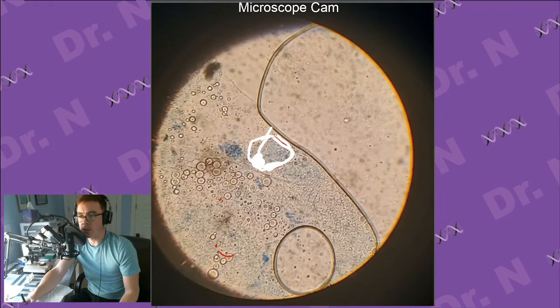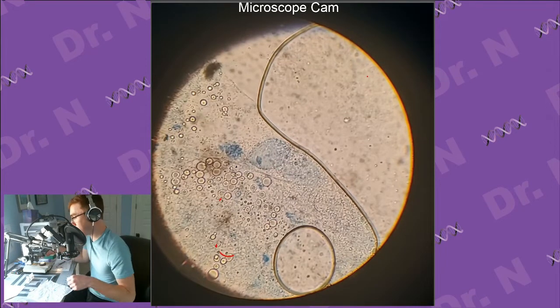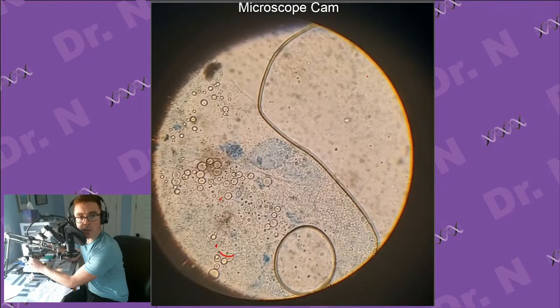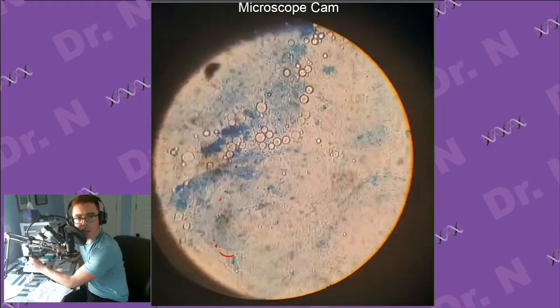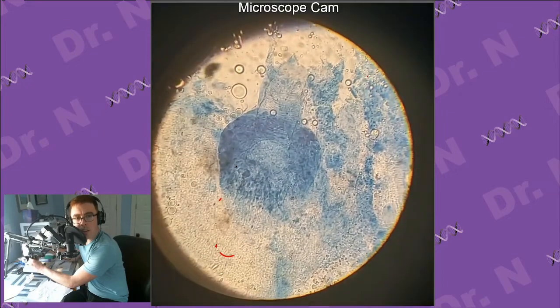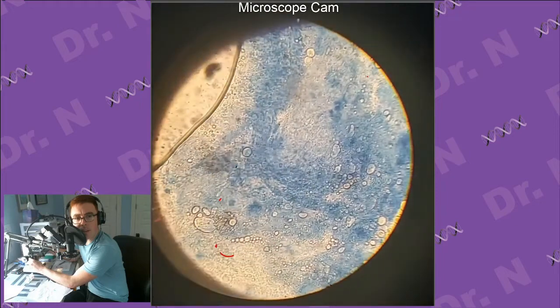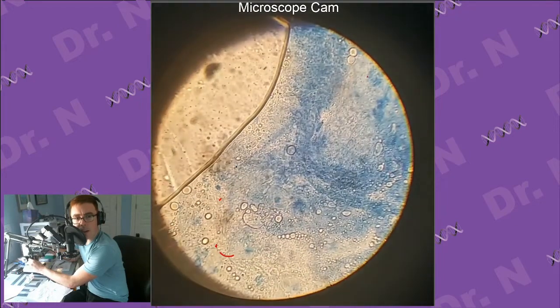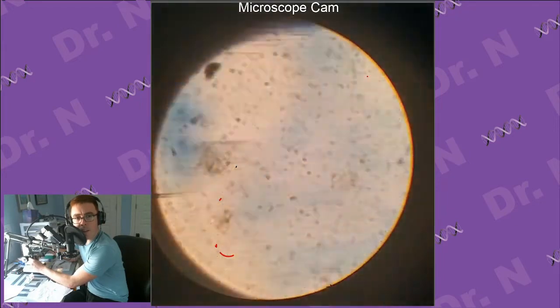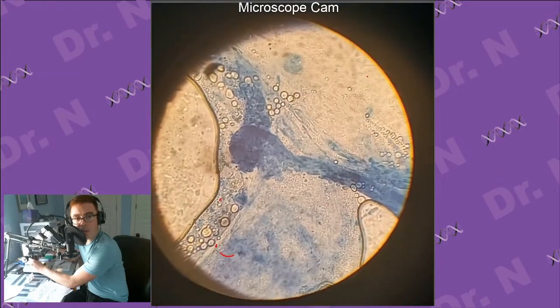So these cells that we're looking for should be much, much bigger, way bigger than sort of the average cell. So I don't think we're seeing them quite yet. So I'm going to just zoom around a little bit more and see if we can find them. I'm almost wondering if these were it. This big mass of very dark blue. I'm seeing some individual nuclei in there, but I didn't squish them as well as I was hoping I was going to.